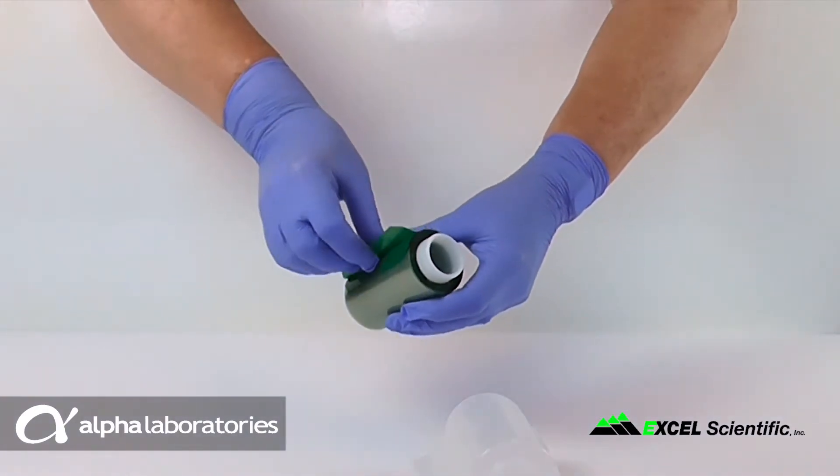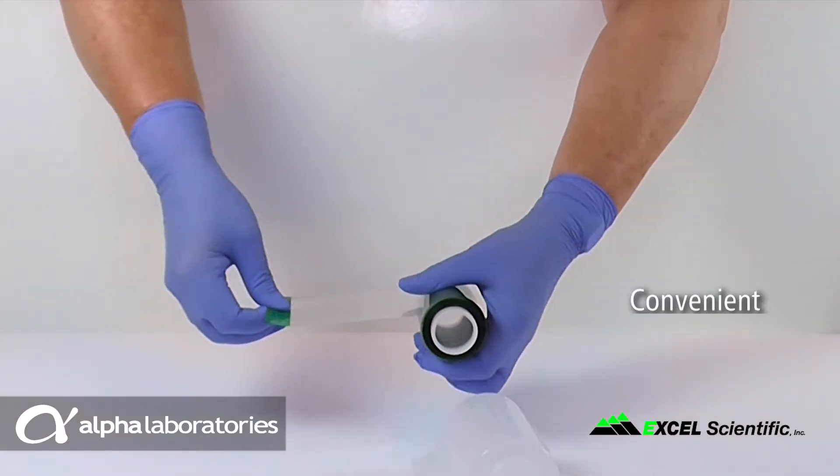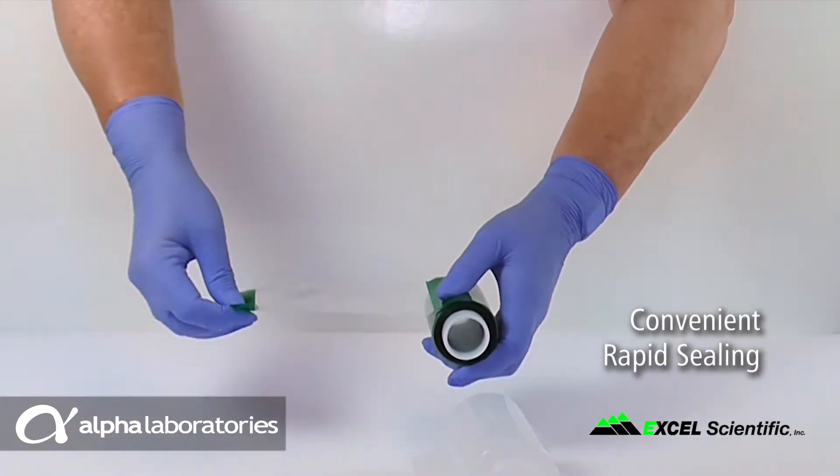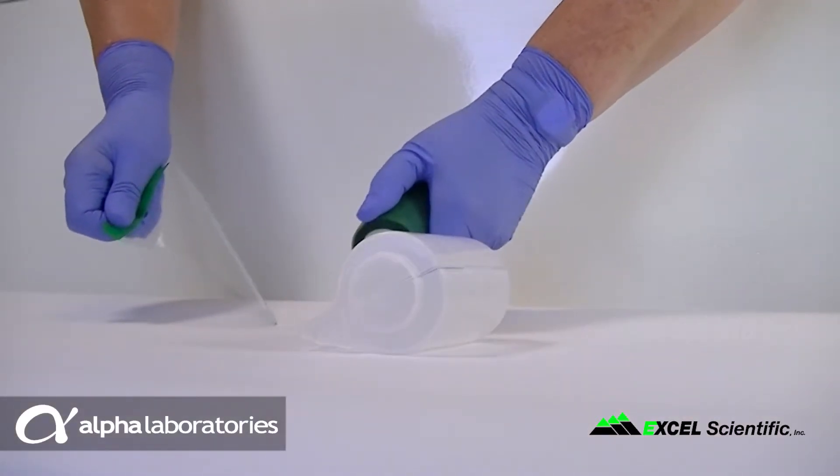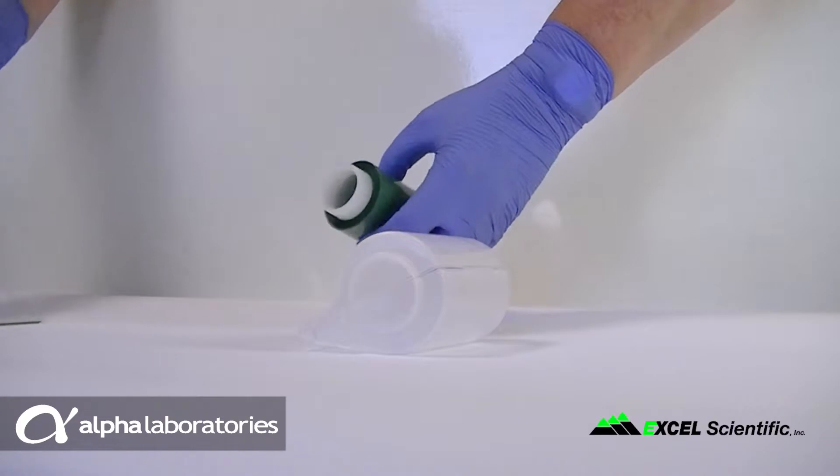This format for microplate films not only provides a convenient and rapid method for sealing but also provides an environmentally friendly product with reduced wastage since there is no protective backing to remove and discard.